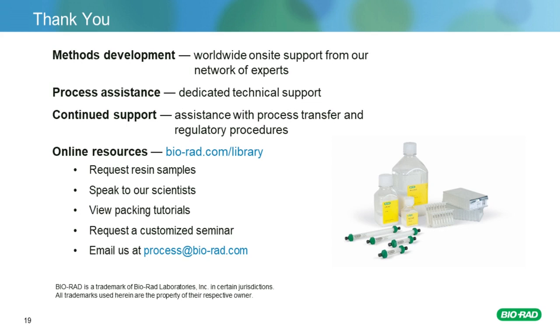Both of them are 50 micron beads. However, they both behave differently when you look at the separation and the formation of aggregate. That's largely due to the structure of each of the 2 resins. So you have to look at both the particle size and the internal structure of the resin to find the proper separation that you're looking for.